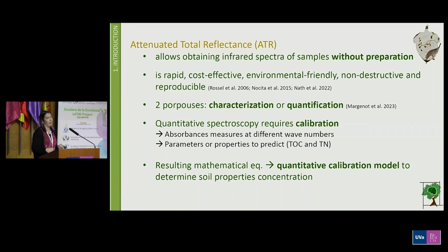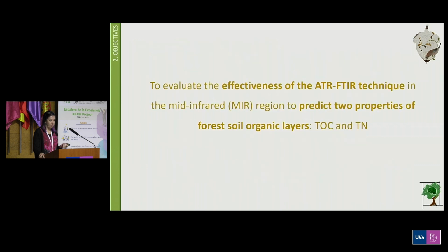The resulting mathematical equation from this process of calibration is the quantitative calibration model that we are going to use to determine soil property concentrations from other, different samples, and that we can use in the future to predict these properties.